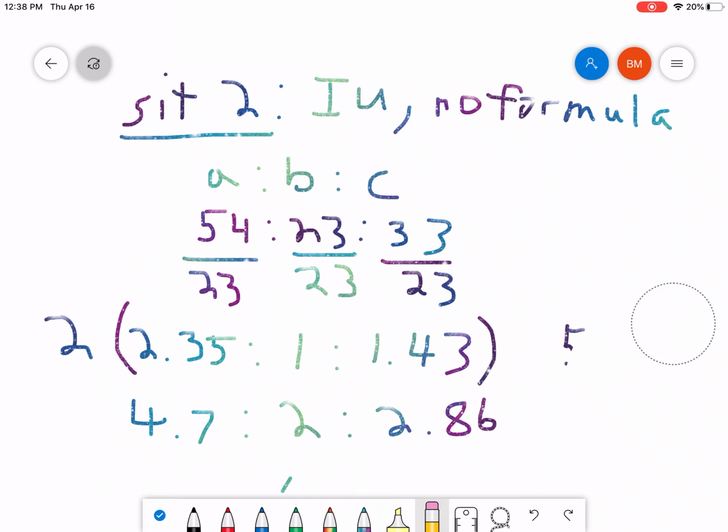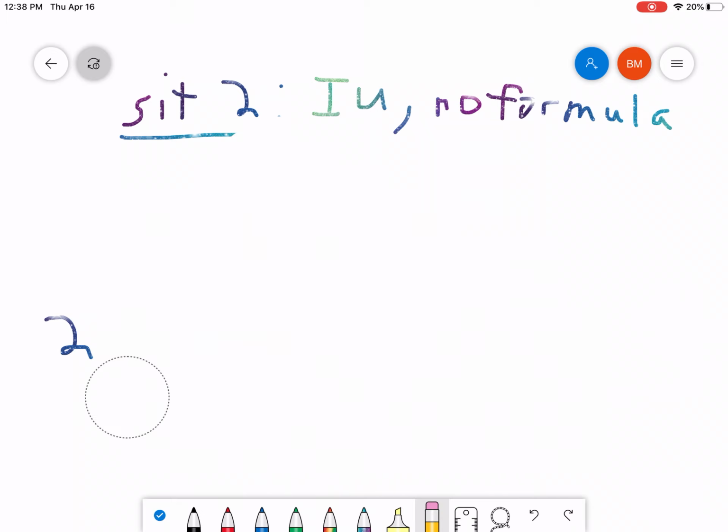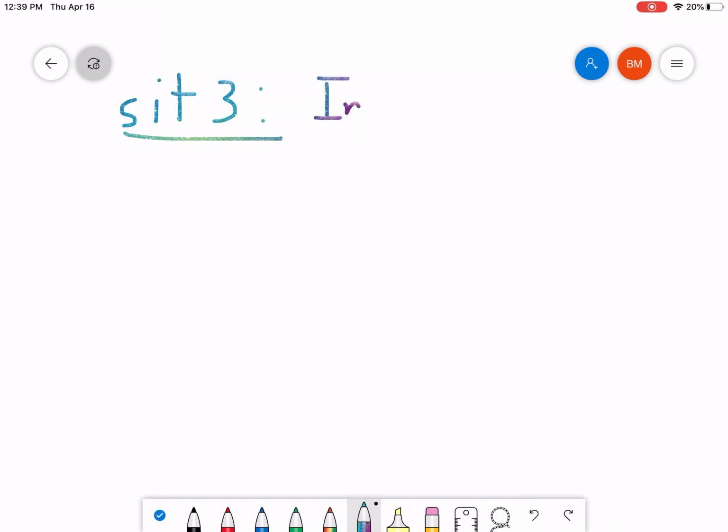All right, the third situation, which is more and more uncommon now that technology and software is more advanced, there are certain situations you might run into where you only have integration curves or integration lines, but not integration units.